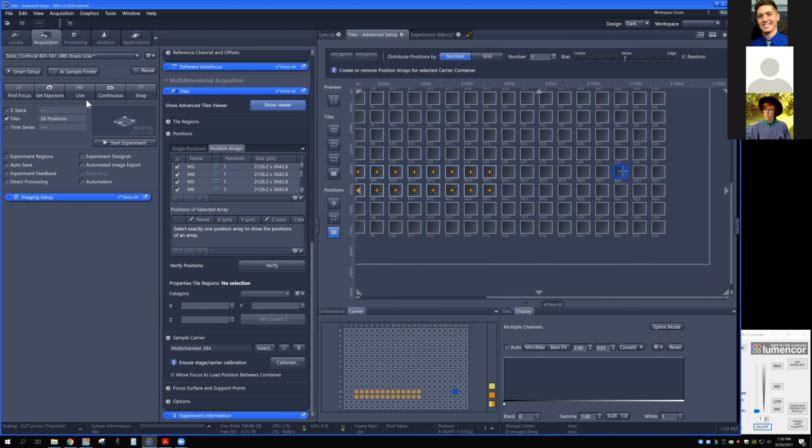And some of these we can just do as an offline session, I think, or like a remote session, but there will be a few more of these to come that I think will be hopefully a little bit more purpose-driven, single topic, shorter, and really working with samples, especially as you have them and specific needs and applications come up.